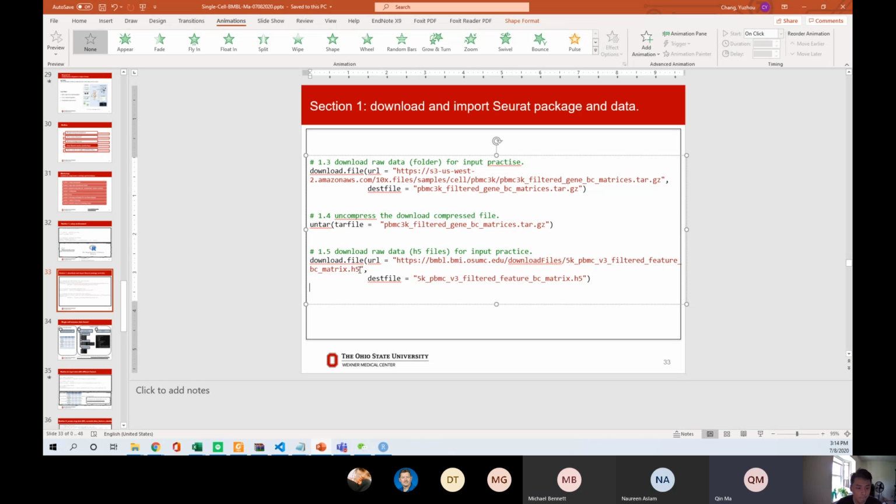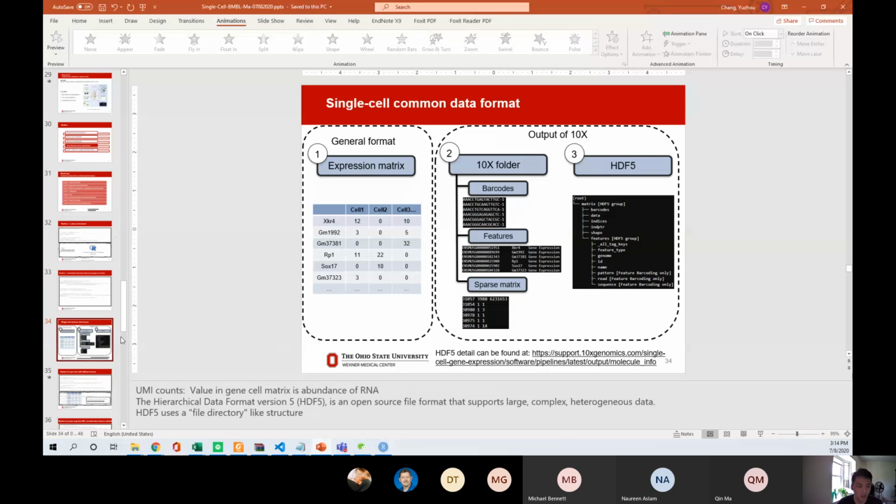So how large is the data usually? It's not large. It's a few megabytes. Okay, then it will work. But today's example data will be loaded from these 3 matrices, so it won't involve this file. So okay, it's not a problem. Let's continue.